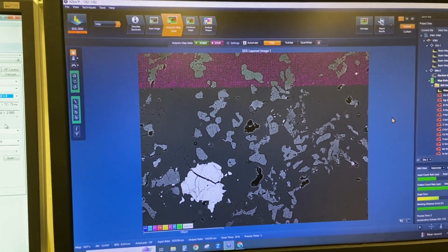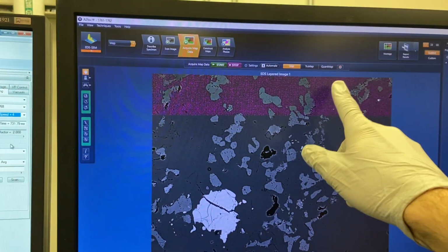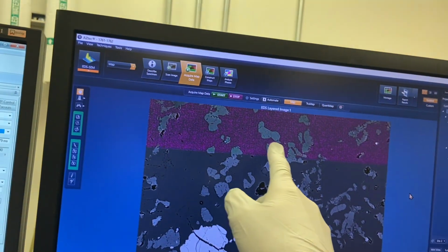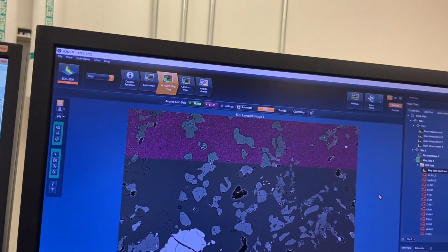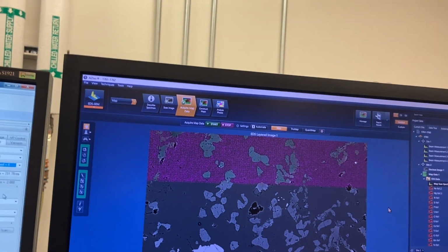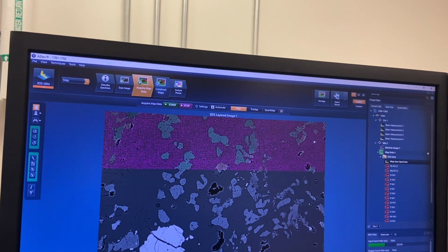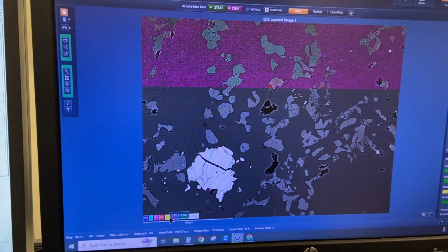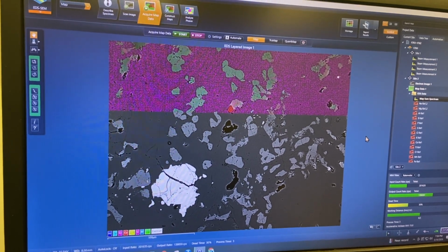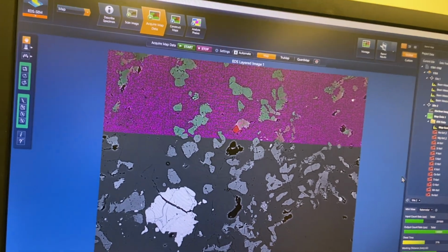Right away I can see we have an area that's like this, that looks like it's maybe rich in silicon. We have an area here that's a little green. This might be rich in some magnesium, and my guess is this is going to be rich in material that's blue. That's my guess, but it could also be something that's a little yellow as well, yellow and blue. So we'll find out. We do see some variation here. This does look to be a little different from this, maybe less magnesium.